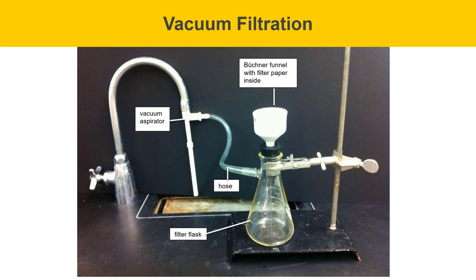Another type of filtration is called vacuum filtration, which involves using a vacuum source to speed up the filtration. The apparatus consists of a filter flask clamped to a ring stand, a hose connected to a vacuum aspirator — when you turn the water on, a vacuum is pulled through the hose and through the filter flask. On top, there's something called a Buchner funnel that has a circle of filter paper inside. When the vacuum is going, you can pour your solution through this filter and it will rapidly filter your solid-liquid mixture.